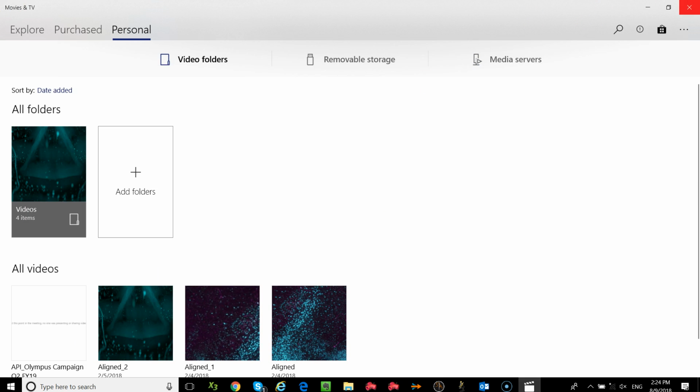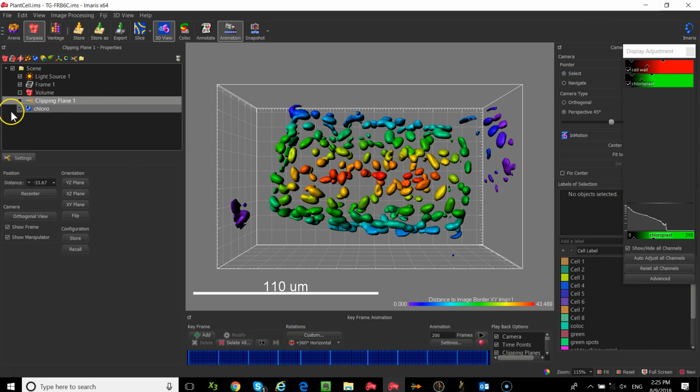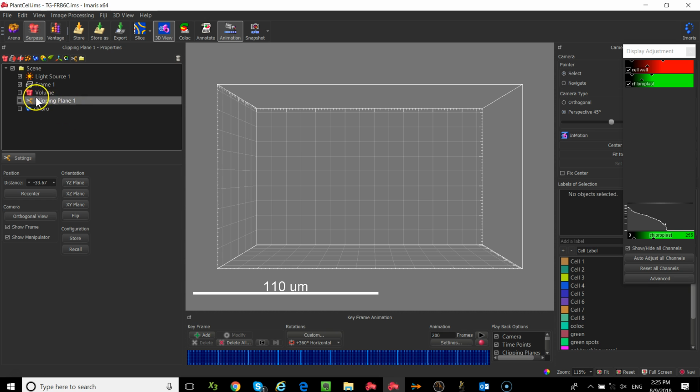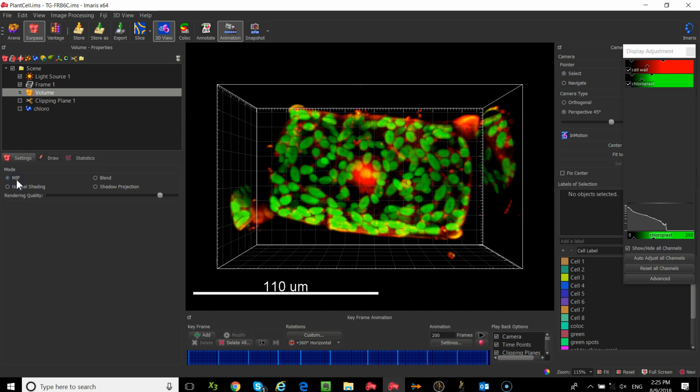Okay. So, let's close this down. Now that we're done with this, I'm going to turn the surface off, and let's put the volume on, and I'm going to go back to maximum intensity projection. So I'm kind of resetting here a little bit. At the top of your screen, you will see a little dialog called Colloc.